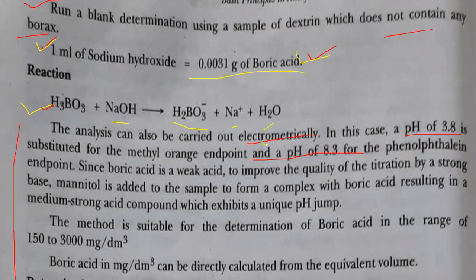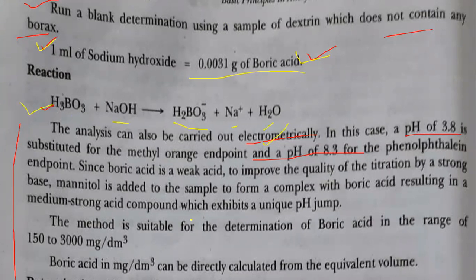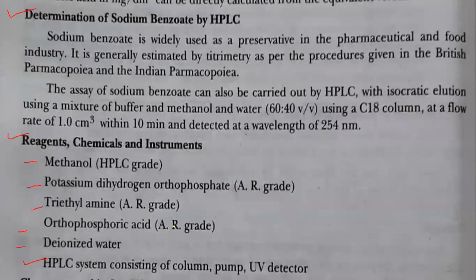Electrochemically also we can detect it there, but here as we are studying titrimetrically, no need to go for the further process. That is enough of what we have learned using methyl orange and phenolphthalein. Second is the determination of sodium benzoate with the help of HPLC.